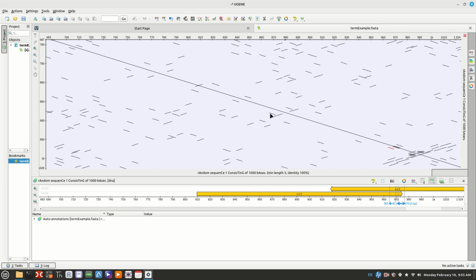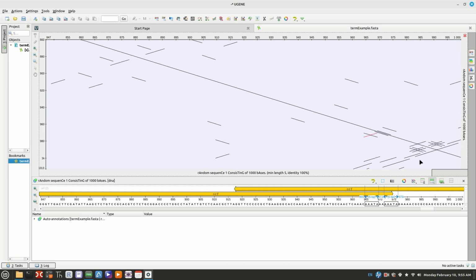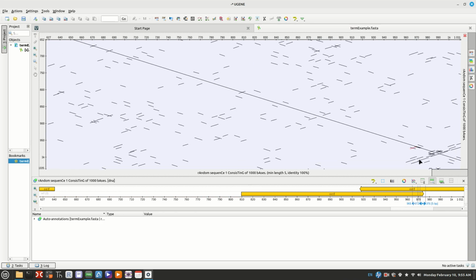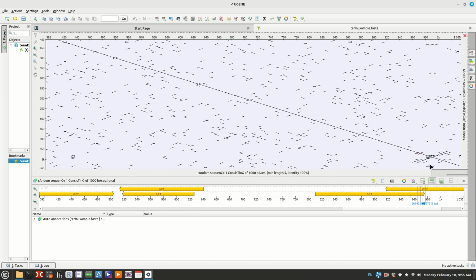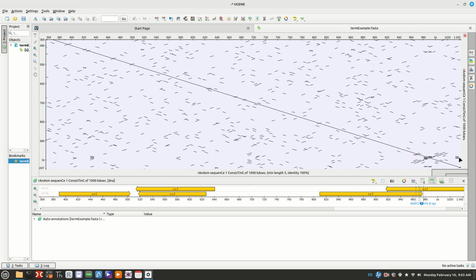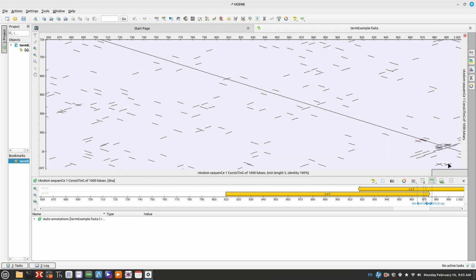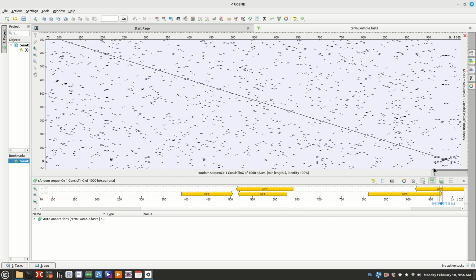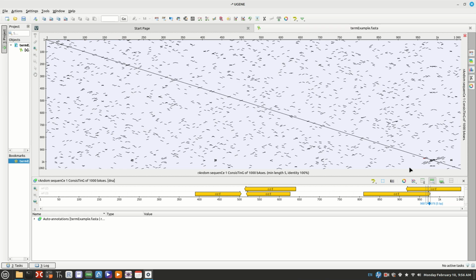It could be the other way. The line could be on this one, could cross it in the middle, could cross out here. Usually it's going to cross out here. The way we did it, it crossed pretty much through the middle, and it's kind of like they're on top of each other. Here you see some that are kind of out here. Now the thing is, are they over here? Yes, they're over here. So that's a good indication. So these tic-tac-toe ones and then these regular ones here, this is what I was talking about, T's. And you want that. That's what you want to find.